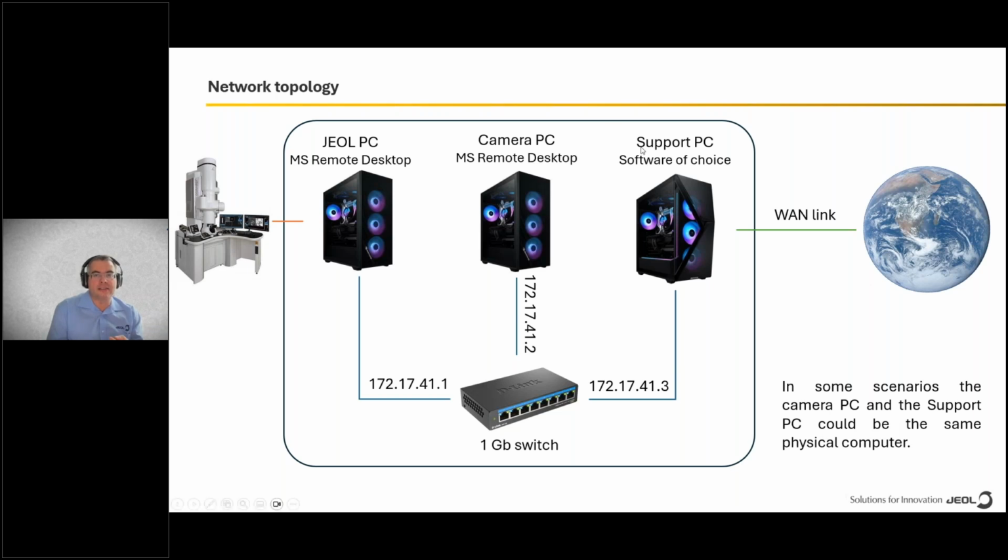I called it here a support PC, and you can connect this computer to the same network where the JEOL computer is located, so they could all communicate. Why would you do that? For example, to provide external internet connectivity to your local microscope network.